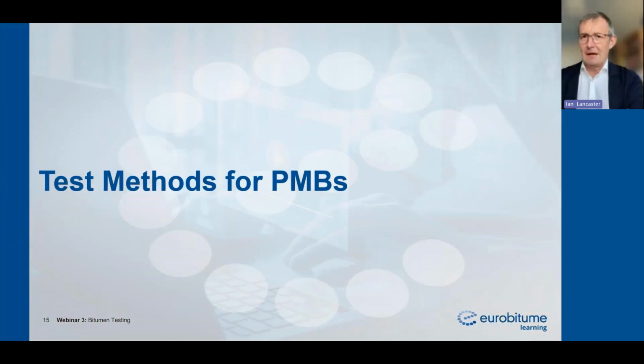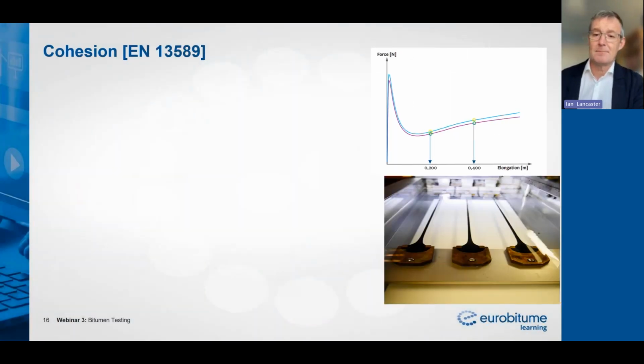So far, I've only looked at the test methods for paving grade bitumens, effectively. When it comes to modified bitumens, polymer modified bitumens in particular, we need other methods to describe the performance and behavior of the binder. So let's look at some of those now.